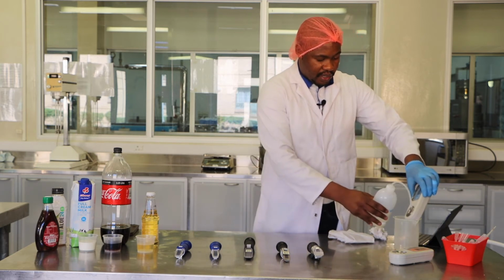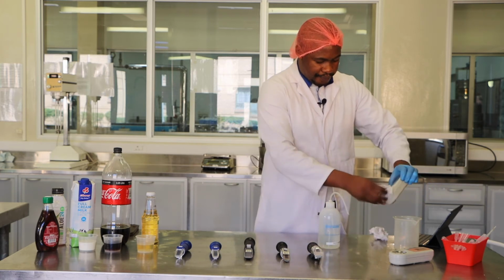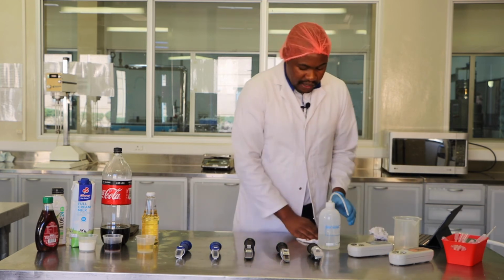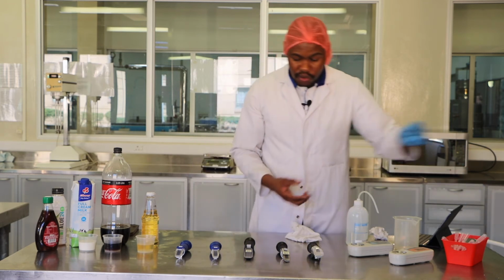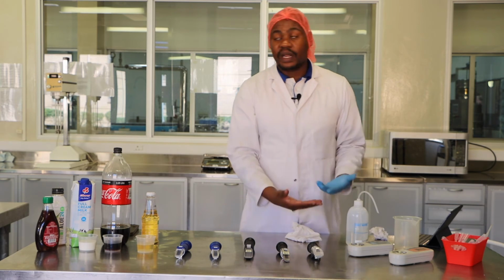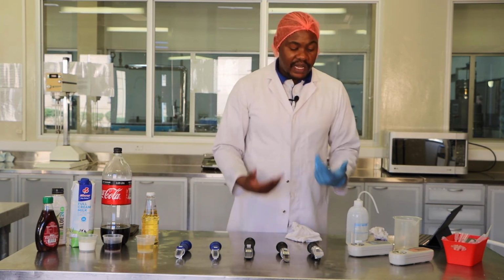And then when you are done with your first solution, what you can do is clean the refractometer. If we want to double check the same solution, we already know that the sugar concentration in Coca-Cola is even less than 10%.